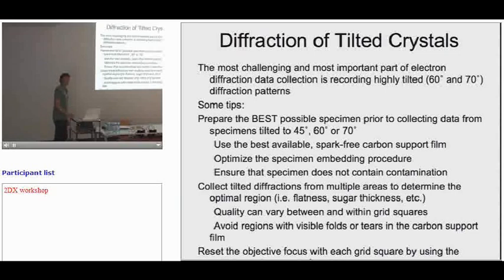Did you have a question, Tom? Yeah, and this was another thing that was discussed earlier. Some crystals just seem to be happier in the sandwich, and some don't prefer it quite as much. And for me, it is much better in my hands. And that's also the case. We've had a few other people work with aquaporin 0 2D crystals, and consistently we get better data with the carbon sandwich.